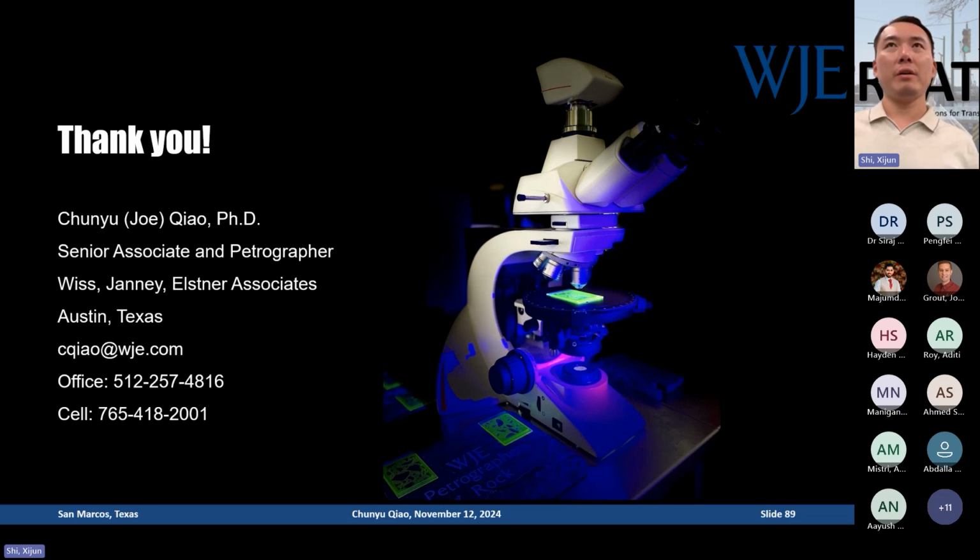ASTM C457 has very, very specific requirements for the areas you want to analyze and how you do the air void analysis. There are three major methods in ASTM C457. Method A is the linear traverse method, method B is the point count method, and method C is the enhanced contrast method by flatbed scanner. So at WJE, we normally do method B, which is the point count method. You have a lapped section from your sample, and you decide the specific area you want to analyze based on the standard.